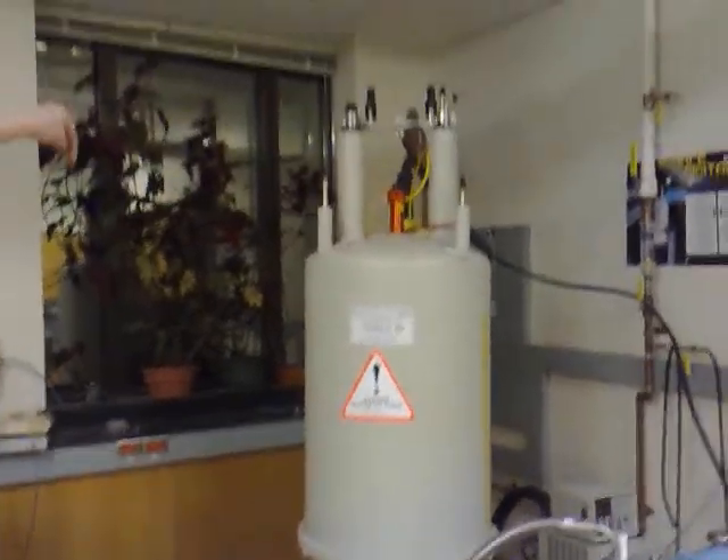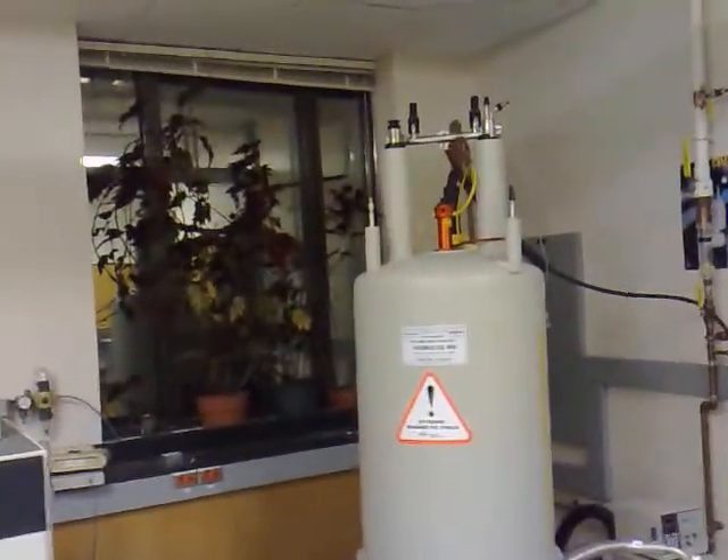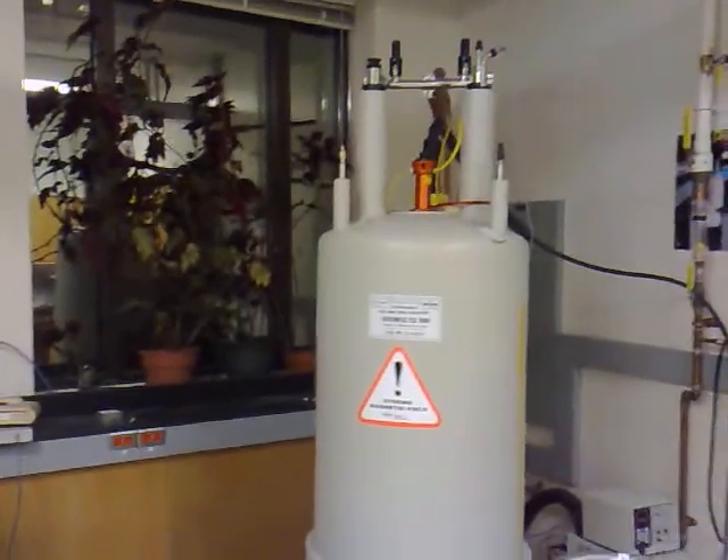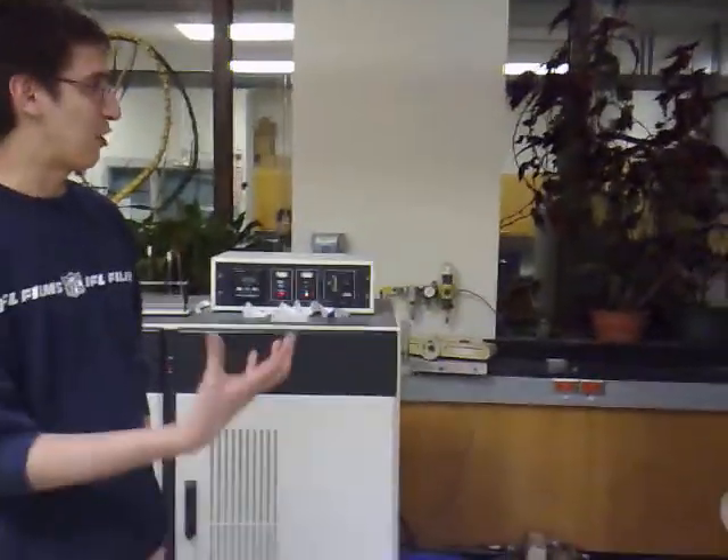We put samples inside NMR tubes like this, so it's in a solution. We put the sample in the magnet, and it basically excites all the protons in the molecule, and we get a spectrum that helps us figure out the composition of our compound.